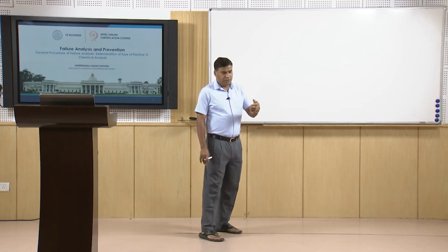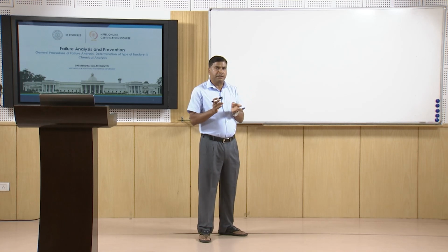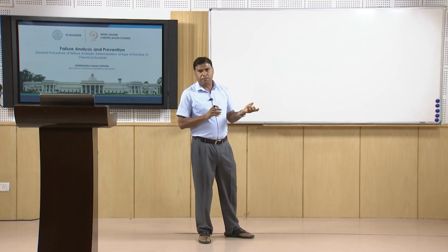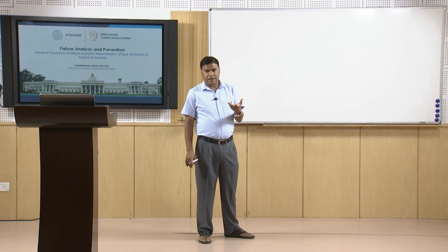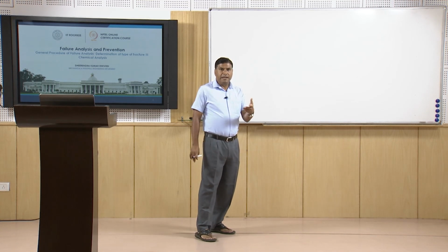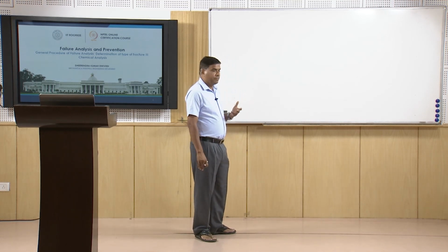Under that we have talked about the dimple fracture, cleavage, how to determine the way by which fracture has taken place, considering the microstructure, macroscopy and micrography of the fracture surface. So whether it is ductile fracture having the dimples on the fracture surface, or it is brittle with the intergranular fracture or cleavage facets, or any other form of the fracture like hydrogen induced cracking or the creep.